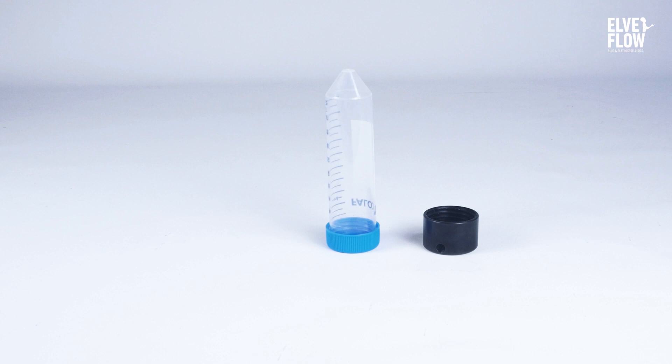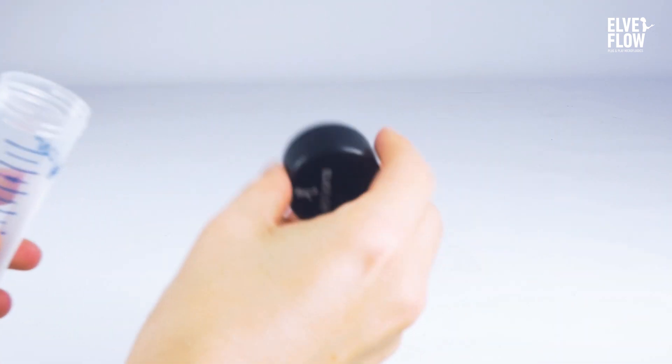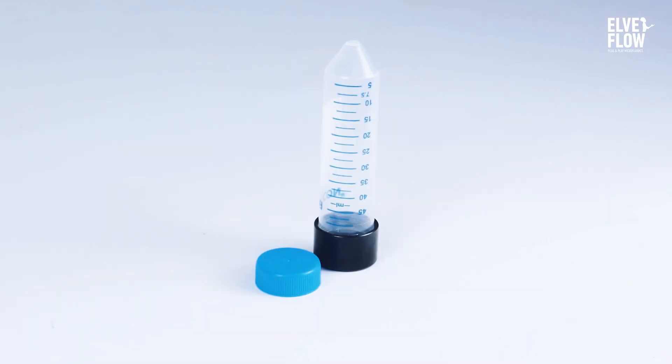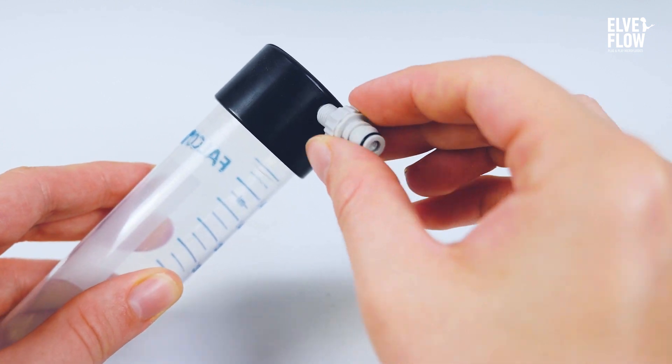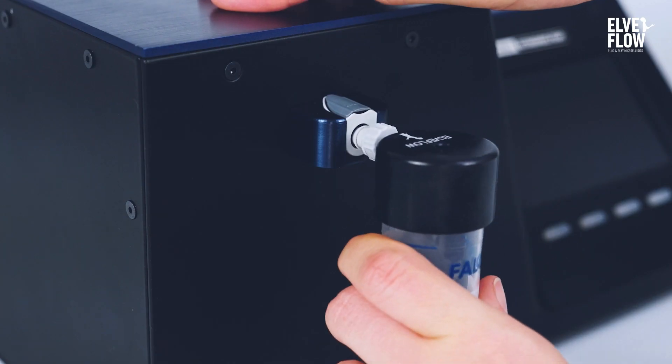This step is really easy. Screw on the pressurized reservoir cap. Then, let's plug and play — fix the quick connect fitting to the cap and plug it into the Cobalt.